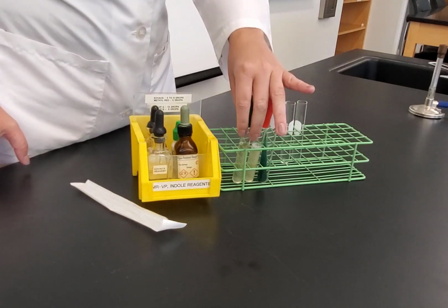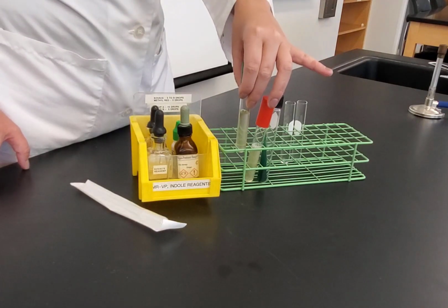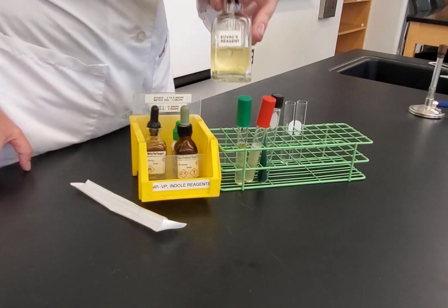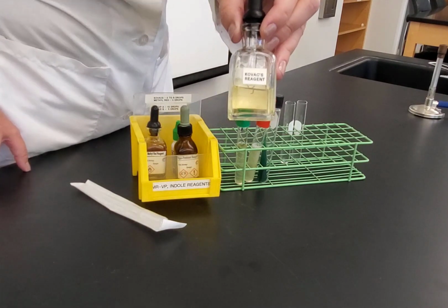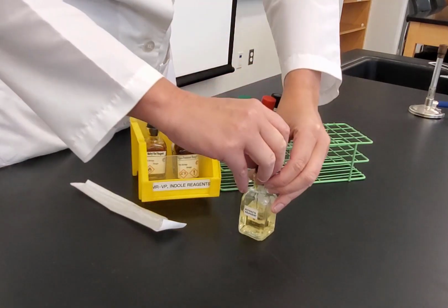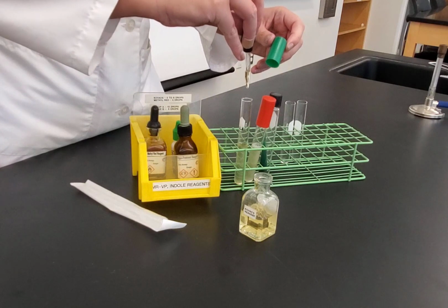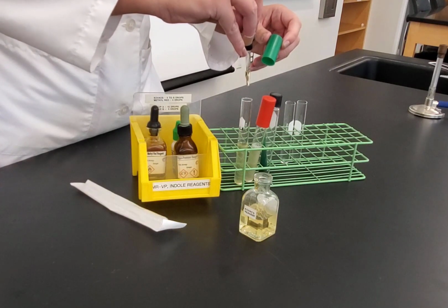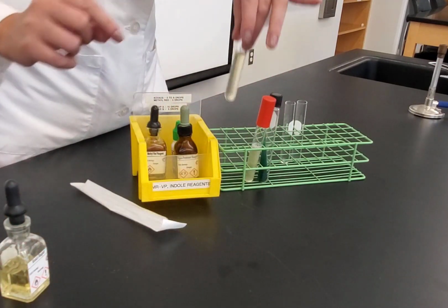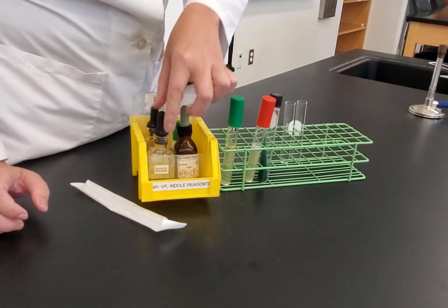So what I need to do is that for my tryptophan broth, notice that there is some turbidity, there is some cloudiness. So that tells me that the bacteria grew. And for my tryptophan broth, I need to add my Kovacs reagent. So here's my Kovacs reagent, and I need to add 7 drops of Kovacs. So I'm going to take my Kovacs, and I'm going to add my 7 drops. 1, 2, 3, 4, 5, 6, 7. And I'm going to wait to see if a pink ring develops on the top. So I'm done with my indole test for now. So I'm going to move away my Kovacs.